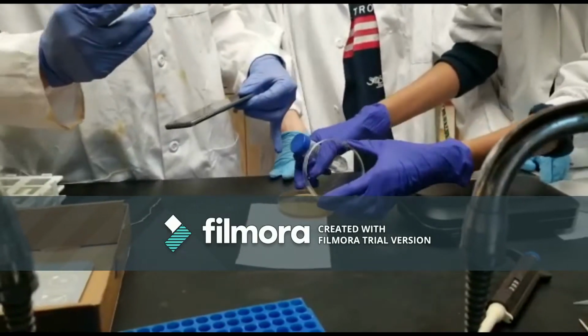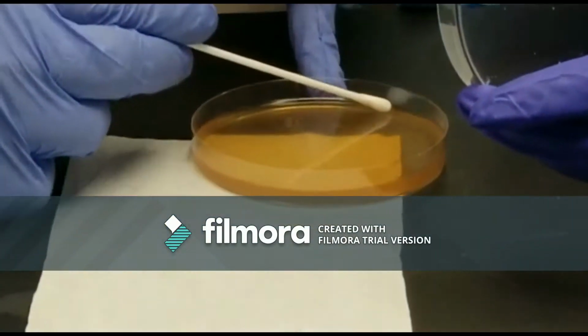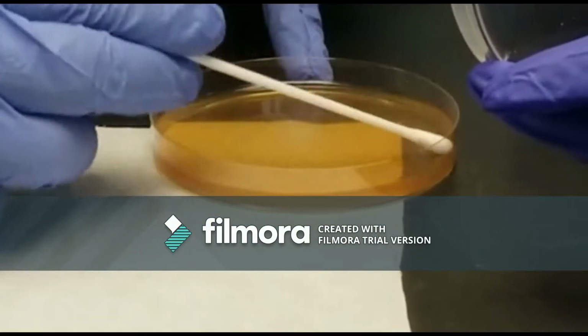A nutrient agar plate was obtained. The first quadrant of the nutrient agar plate was streaked with the swab.